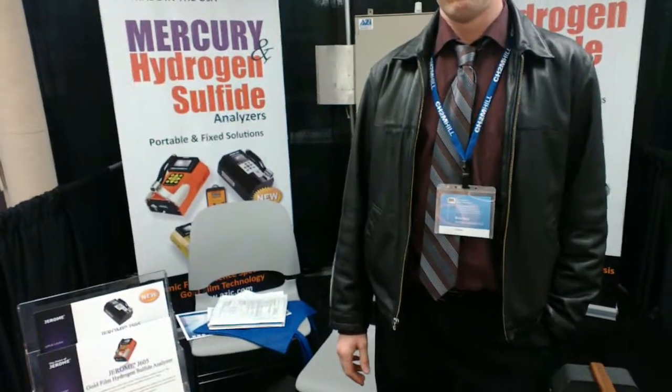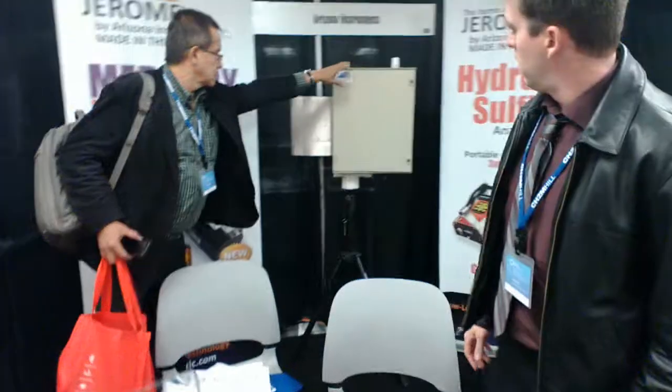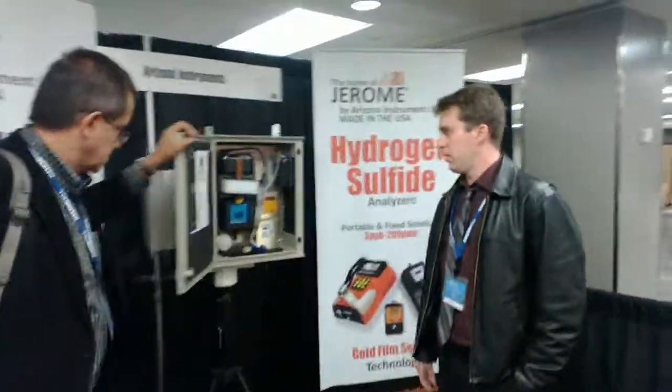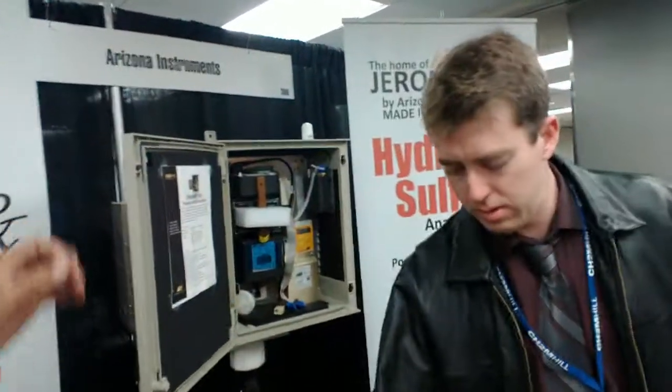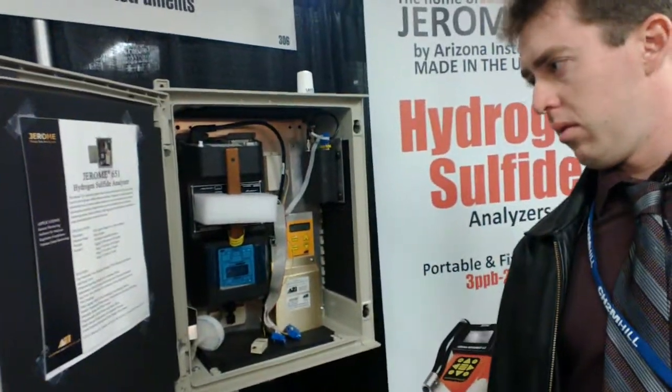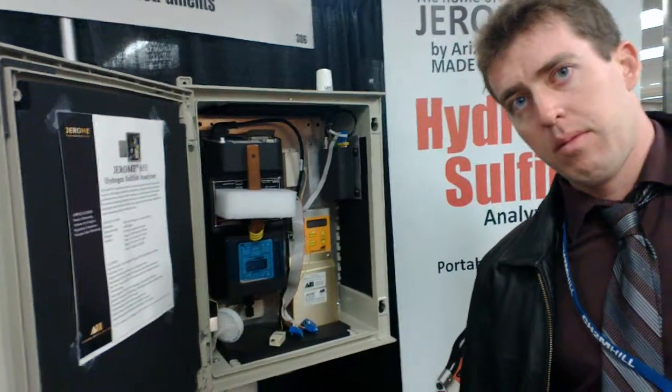Can you speak about the cost of the equipment? In the U.S., this is around $24,000 for the system. And how often does it need to be calibrated? Because sensors tend to drift after a year or two years.